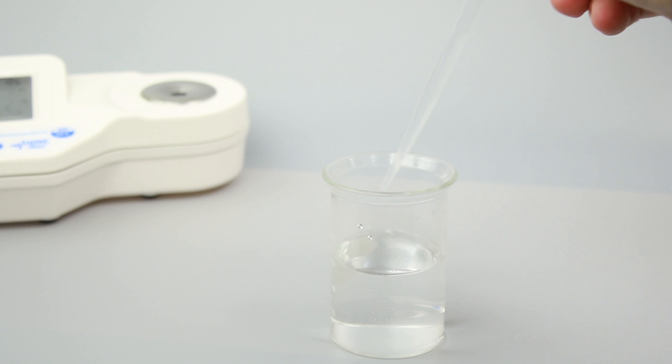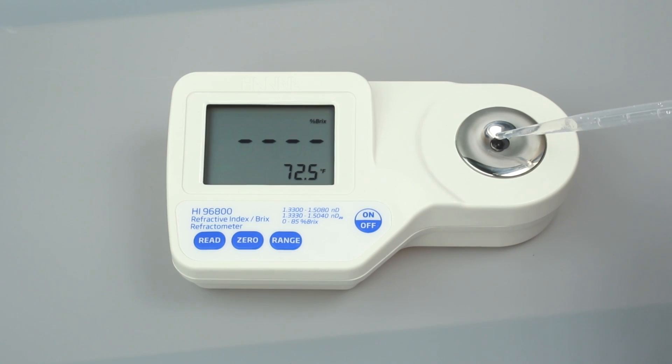Once you have set your units, the refractometer is ready to be calibrated. Calibration is essential for refractometer operation and takes just a few seconds. We recommend calibrating before each use. To calibrate your refractometer, fill a plastic pipette with deionized water and cover the sample prism with just a few drops.